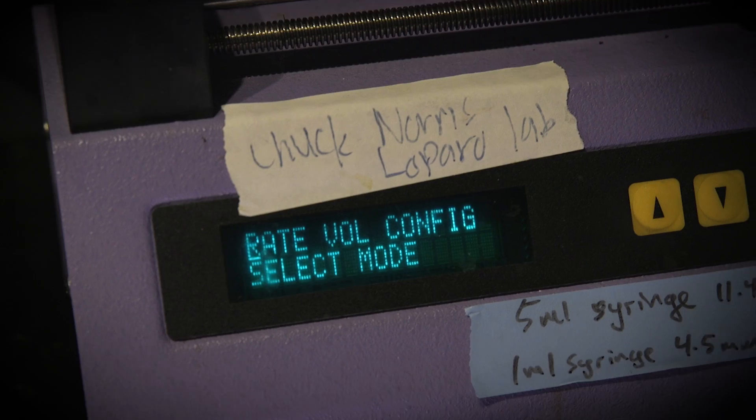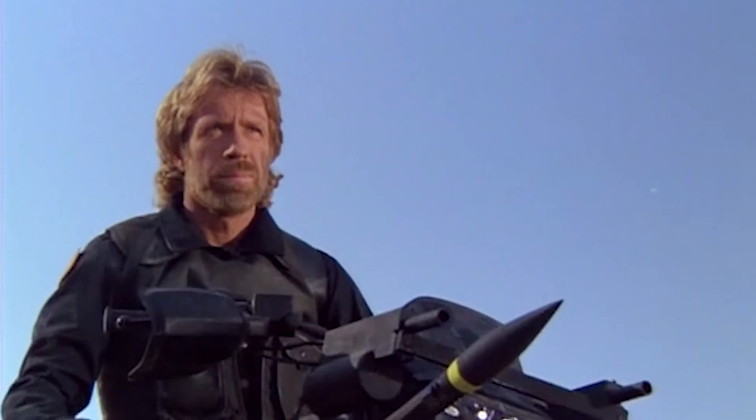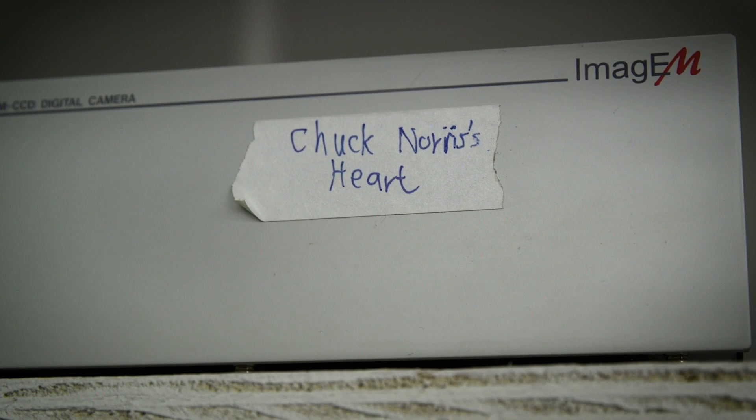My name's Ben Stinson, and the microscope I work on is Chuck Norris. It's a little intimidating at first to work on a microscope called Chuck Norris. The joke is that you don't do experiments on Chuck Norris — Chuck Norris does experiments on you.